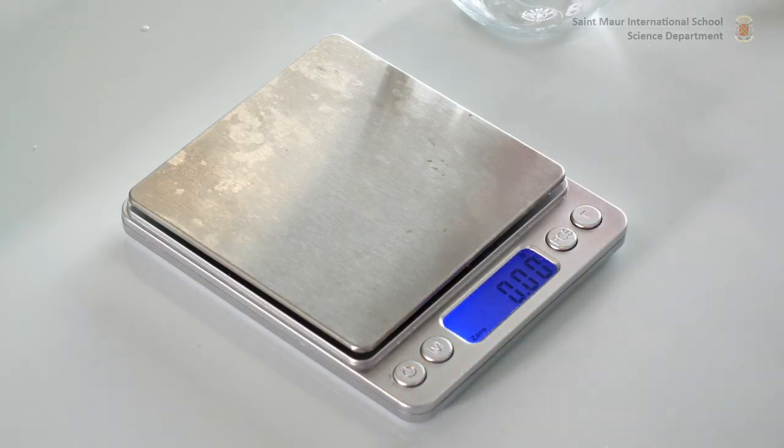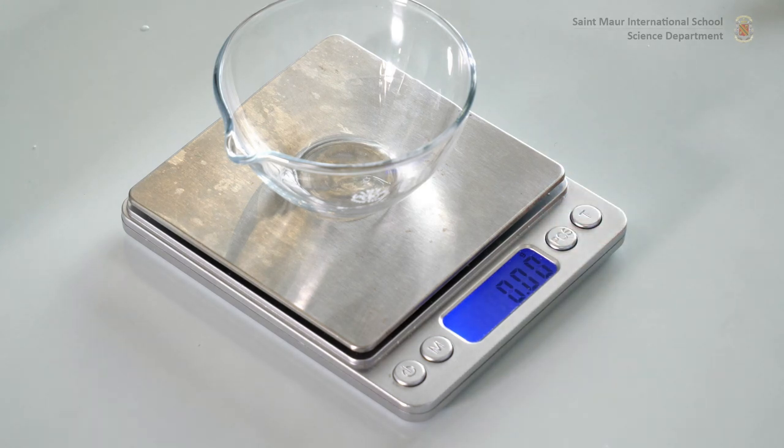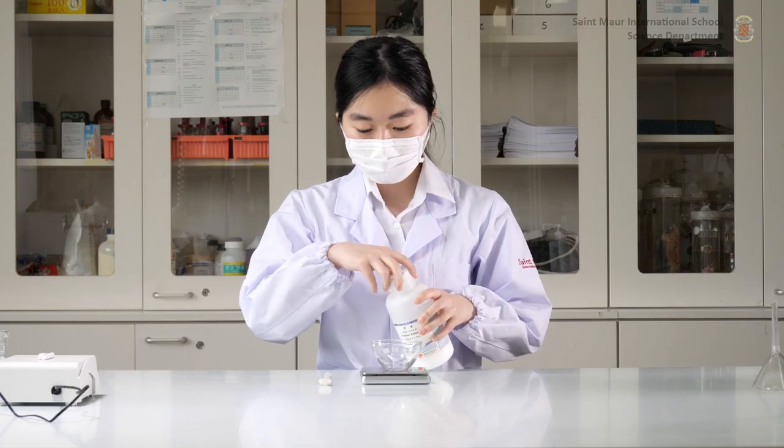Place a weighing dish on the electronic balance. Tare the balance so that the weight of the dish can be eliminated. Make sure to take a note of the balance's uncertainty of measurement.